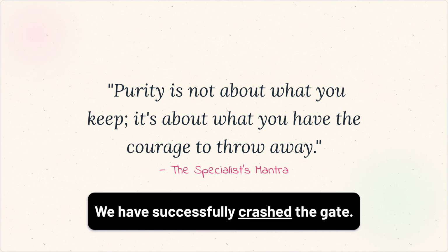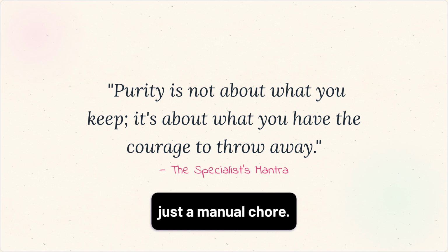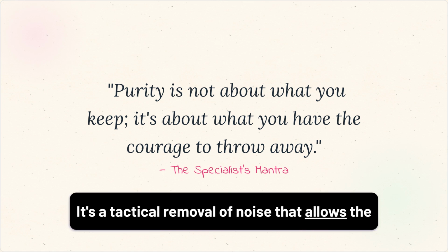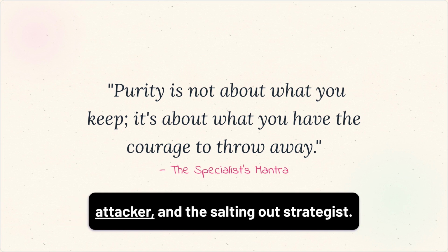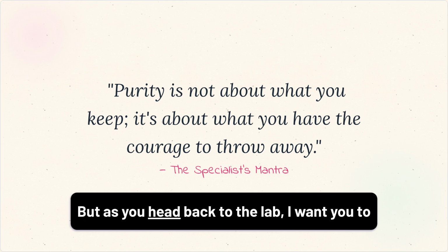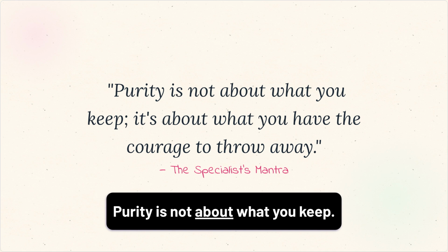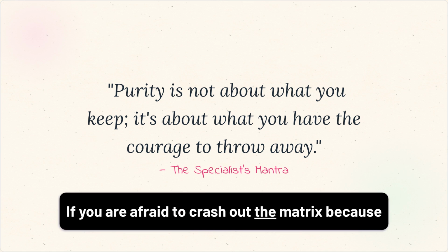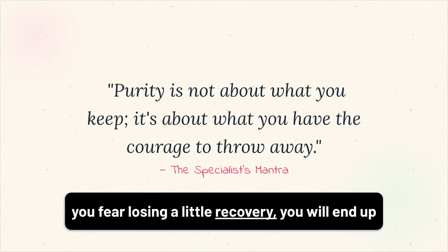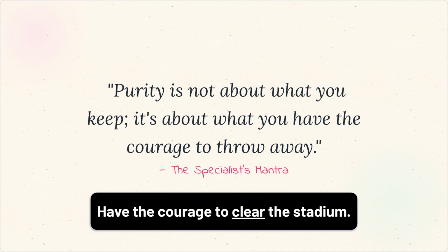We have successfully crashed the gate. We've learned that protein precipitation isn't just a manual chore. It's a tactical removal of noise that allows the truth to emerge. We've mastered the solvent sniper, the acid attacker, and the salting out strategist. But as you head back to the lab, I want you to carry this specialist mantra with you. Purity is not about what you keep. It's about what you have the courage to throw away. If you are afraid to crash out the matrix because you fear losing a little recovery, you will end up with a sample so dirty that you see nothing at all. Have the courage to clear the stadium.